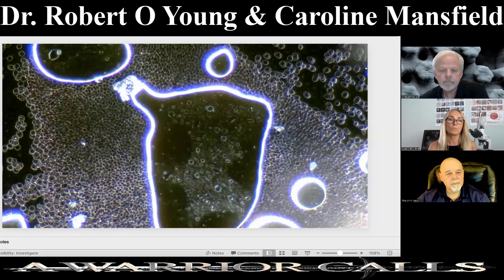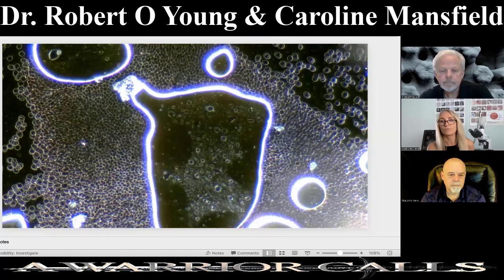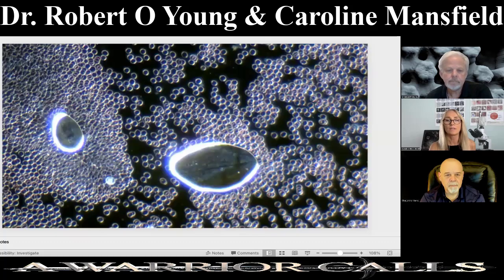So here, what has been shown over the last couple of years, this is what's been named as a polymer hydrogel construction site. And we know that they do have a specific charge, a very positive charge. And this causes the cells to become attracted to each other, to agglutinate, to coagulate. And you can see what's happening around these structures in this particular person's blood. Again, here's another example of that.